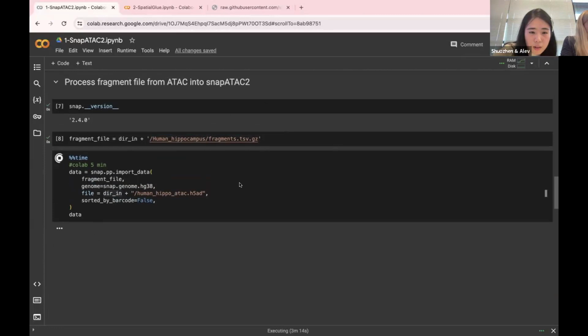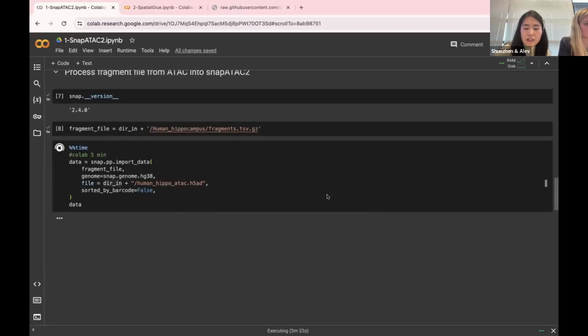So Wang Yun Choi, if you are getting this error saying the Linda requires certain dependency, it's okay as long as there is a successful message at the very end. This error is due to the incompatible package environment, like the dependency resolver here in the Colab, not due to the script. So you can actually run through the script. We just need the very basic function about these packages.